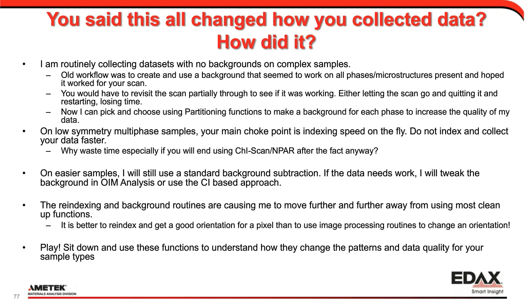And I really think you need to sit down and play. Use these functions to understand how they change the patterns and the data quality for your sample types, and learn what you can do from there. So with that, I'm going to open it up to questions and see what we have.